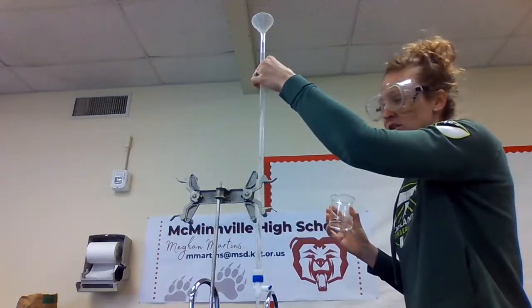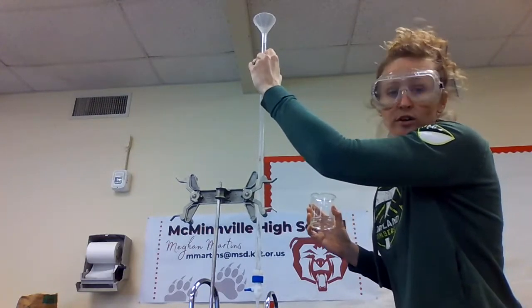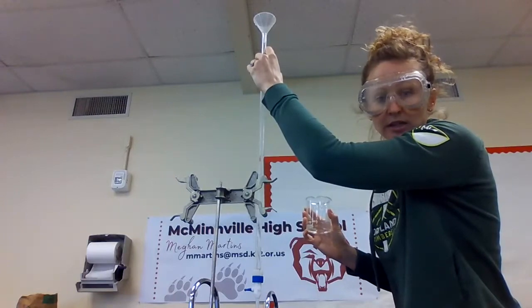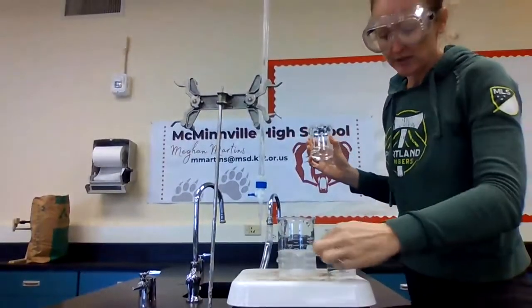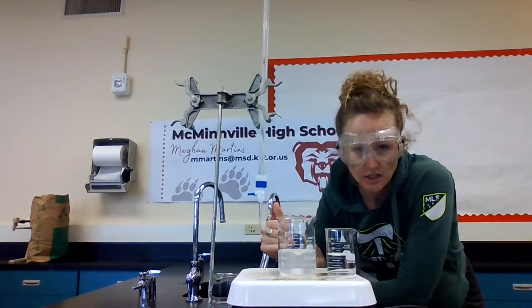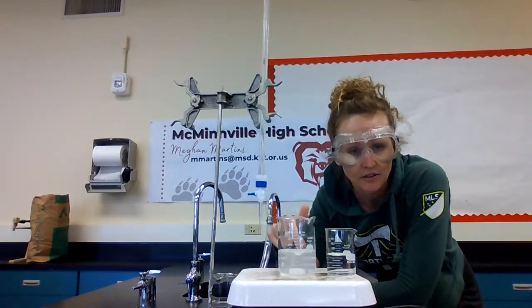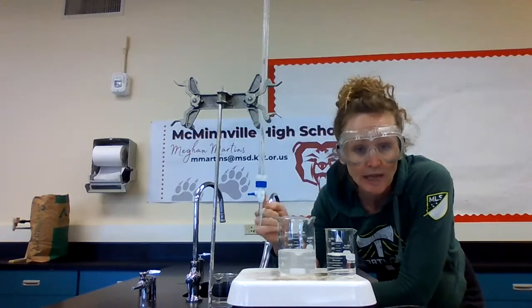Here's your next technique tip. You must know at the beginning of your titration what your starting volume is for your base and what your starting volume is for your acid. Now, I'm just going to show you a titration, and we're not actually going to collect the information and do the math behind it today. We'll do that in lab.